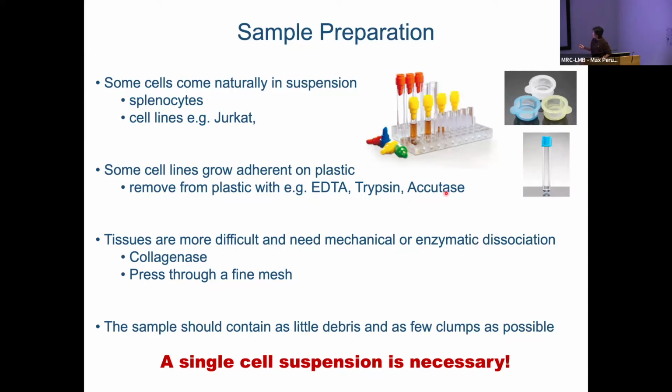Here is a cell strainer. If your cells are clumpy, before you apply them to the flow cytometer, please filter them through this nylon mesh. They come with different pore sizes, 50 micron or 70 micron. For the cell sorter, we have a 70 micron nozzle and a 100 micron nozzle. So, you know, two cells stuck together will block our machines, and we have to start QC again.